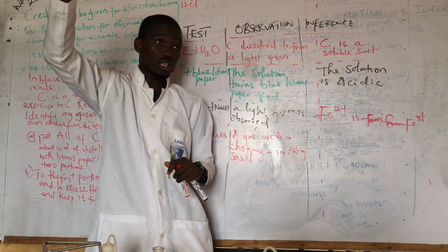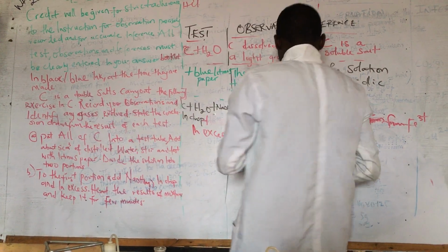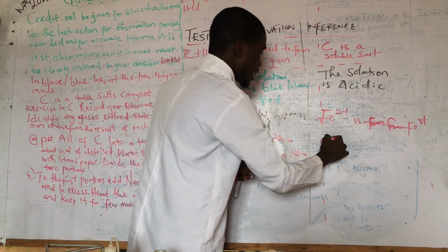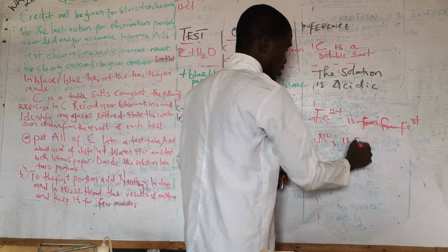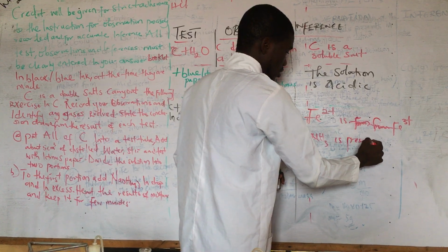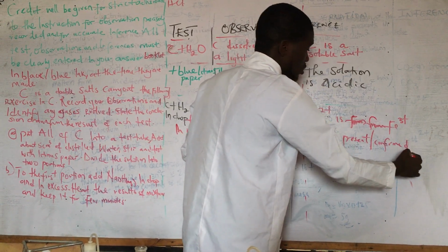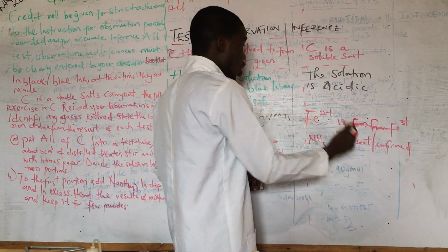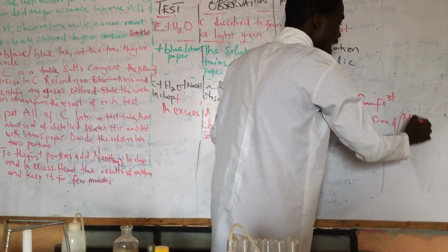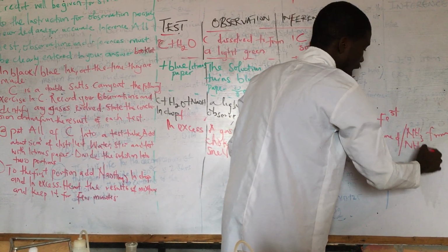NH3 from NH4. So with that, I can say NH3 is present or confirmed. So if you have a choking smell, I use NH3, or to make it standard, I can say NH3 from NH4.